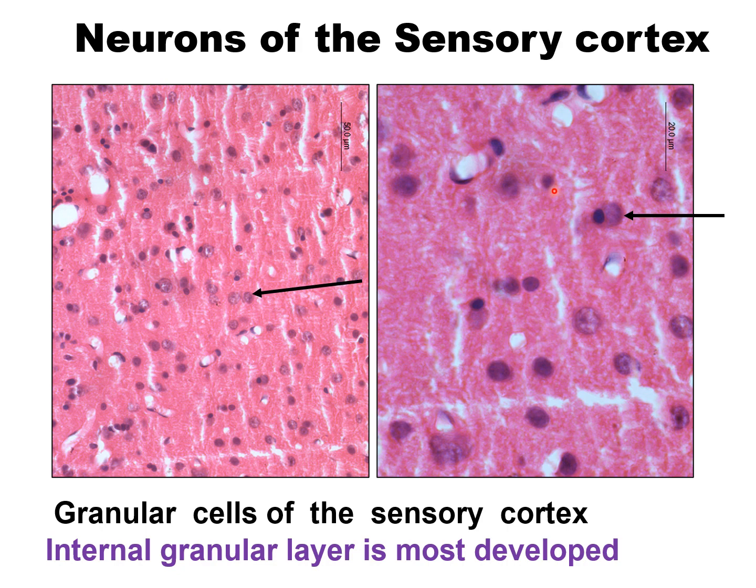Individual glial cells cannot be identified with this hematoxylin and eosin stain. The nerve fibers have taken the stain, and you can see some white areas around the nerve fibers. Those are the myelin. Myelin doesn't take hematoxylin or eosin stain. So this is called the neuropil.